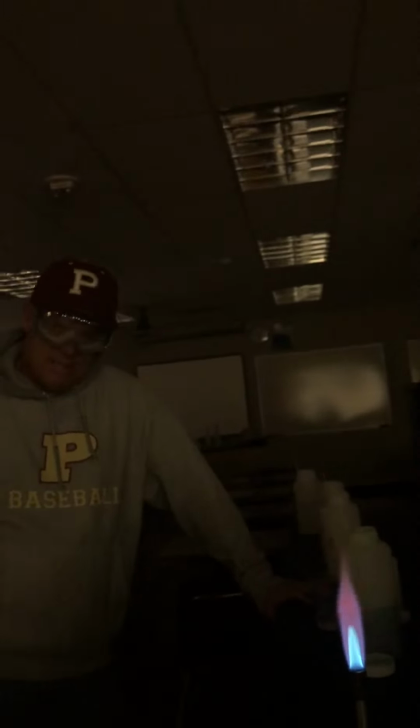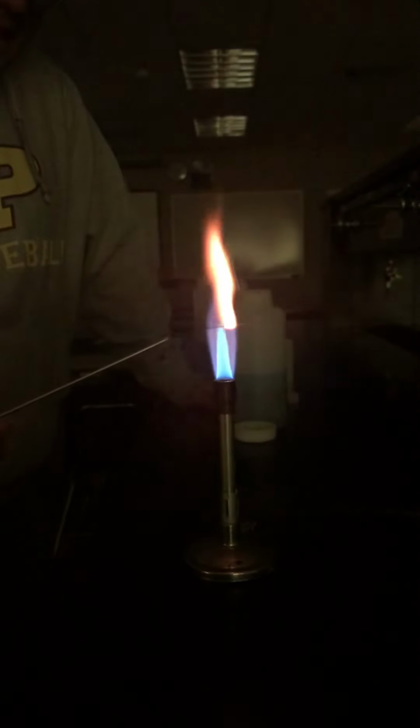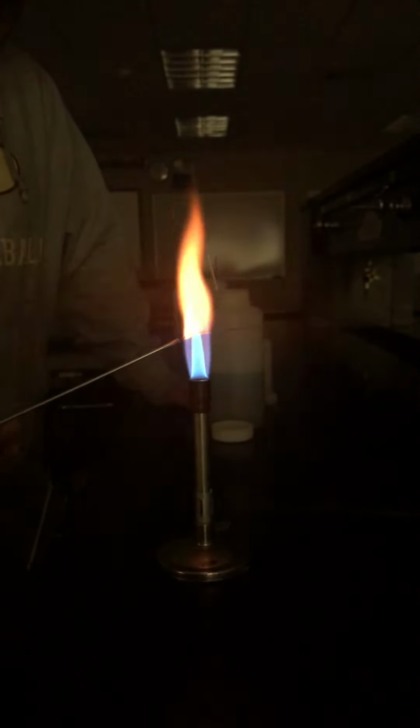Okay, lithium is red. So now what we have is potassium. Let's see how our potassium works. Okay, oh, if you can see it, that was nice.